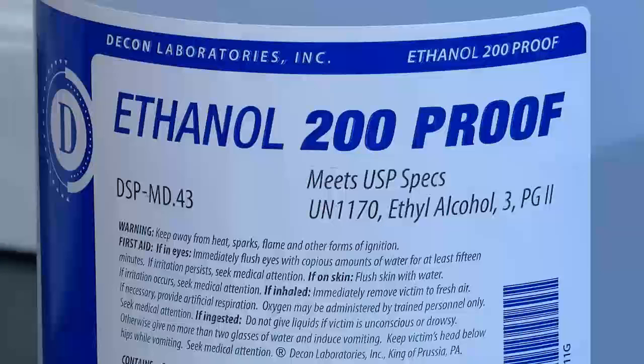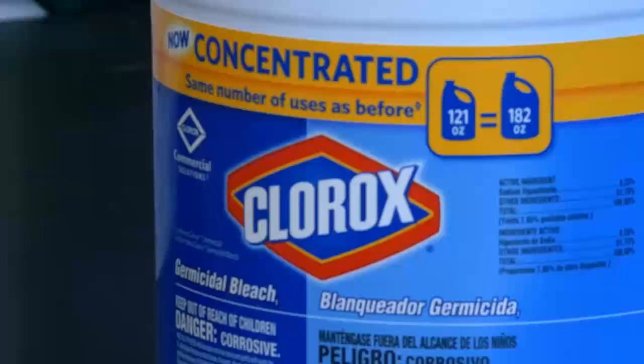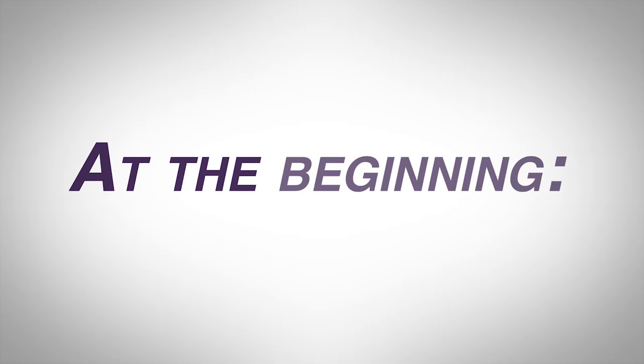Let's talk about lab safety. In this course, you will be working with microbial cultures. You will also be working with some hazardous chemicals that could damage your skin or be dangerous if ingested.